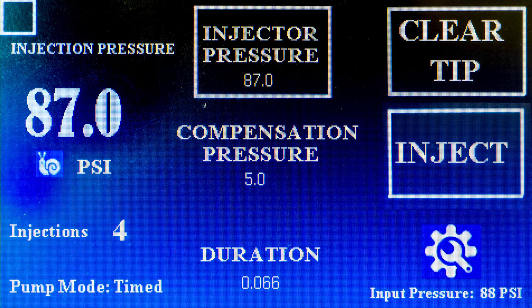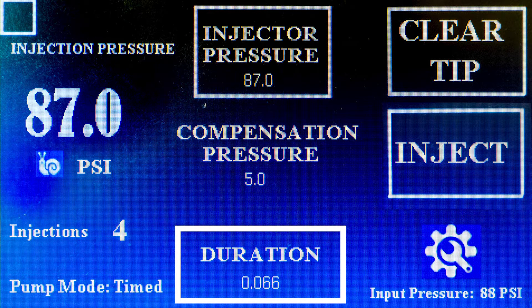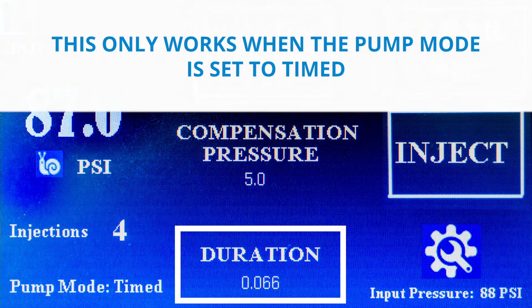The duration indicates the time that the pressure valve will be active once it is triggered. This only works when the pump mode is set to timed.